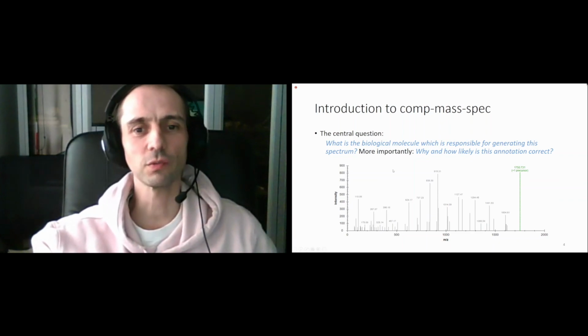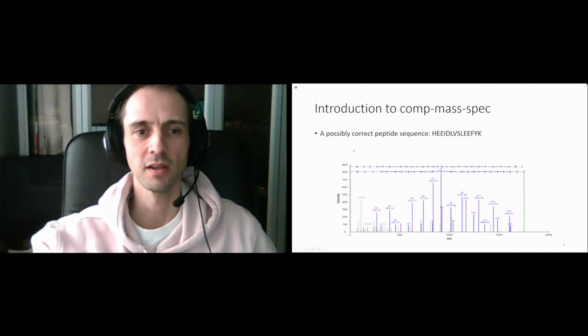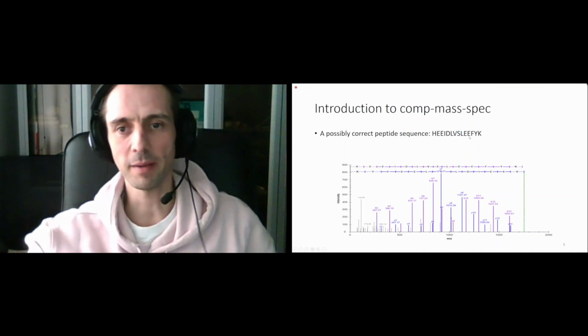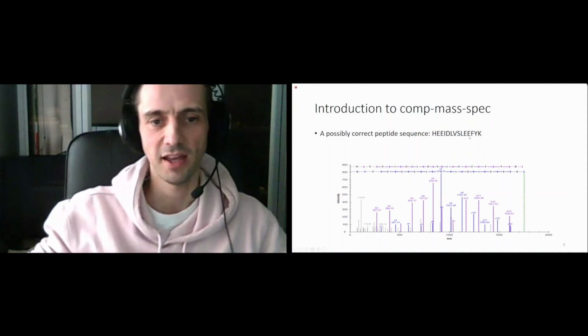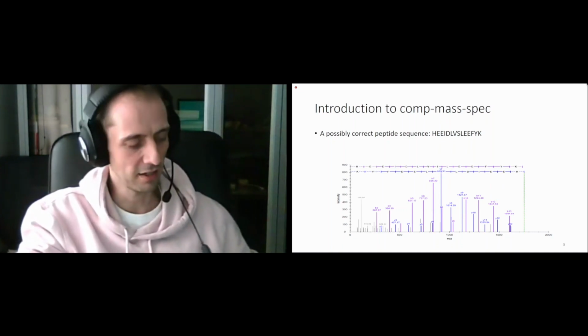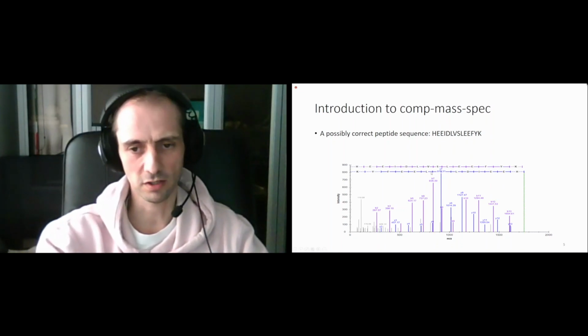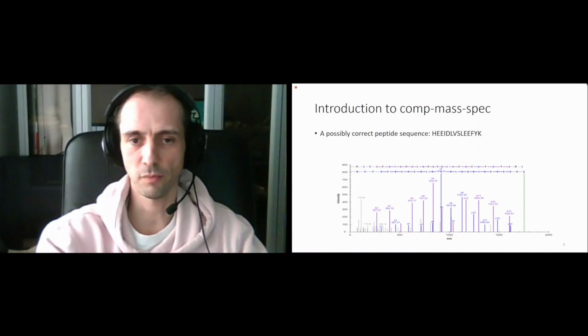It's very likely that this spectrum was generated by this HEEIDL peptide sequence, and this annotation seems quite correct to my eyes.